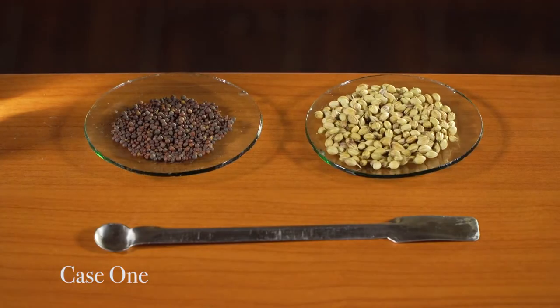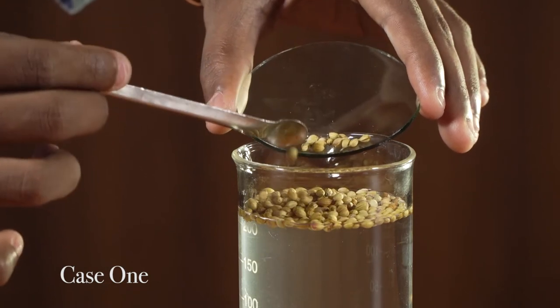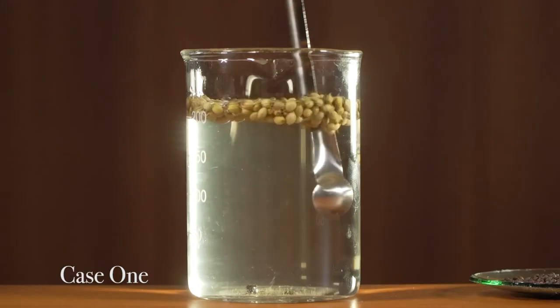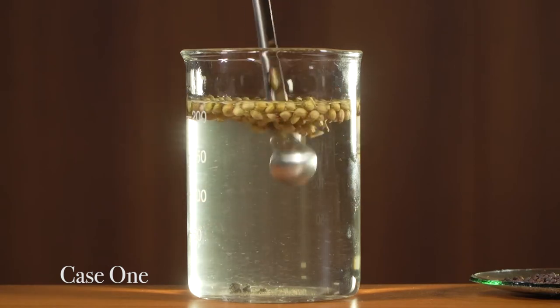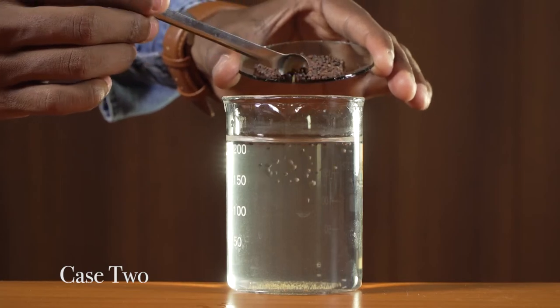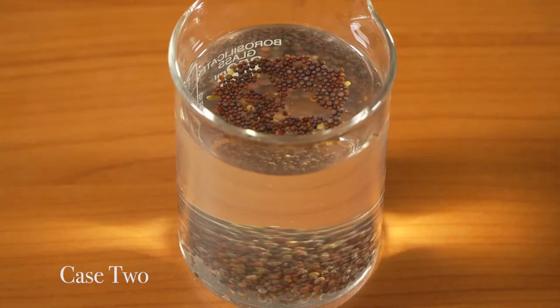How is this process done? Let us see. We will take a sample of seeds, pour them into a beaker filled with water, and gently stir it. We will find that some seeds settle at the bottom whereas some float on the water surface.